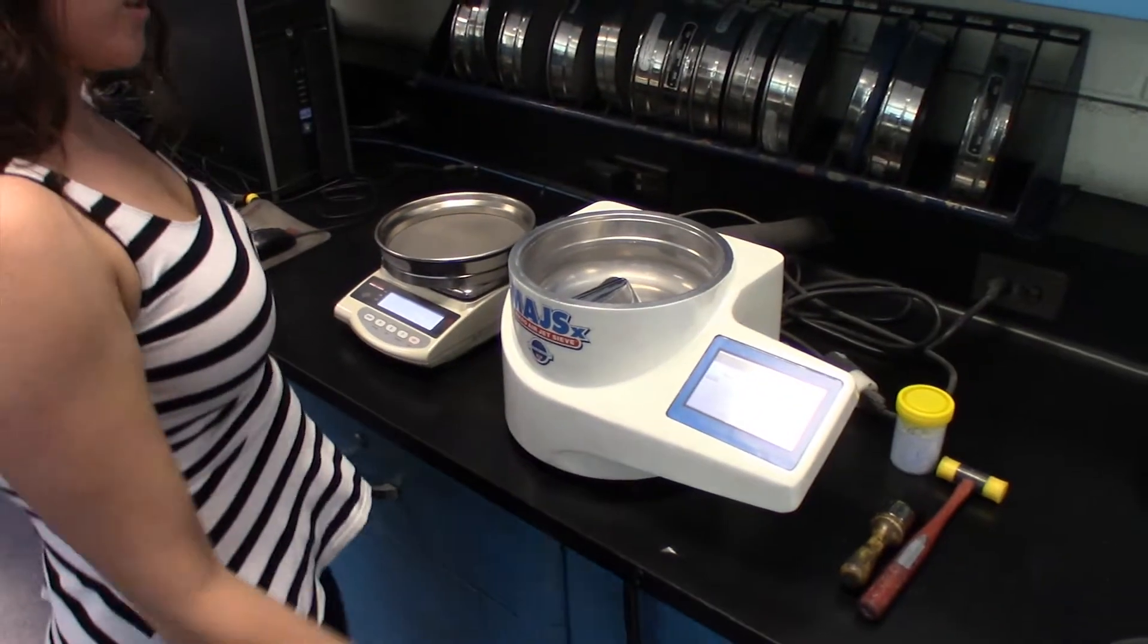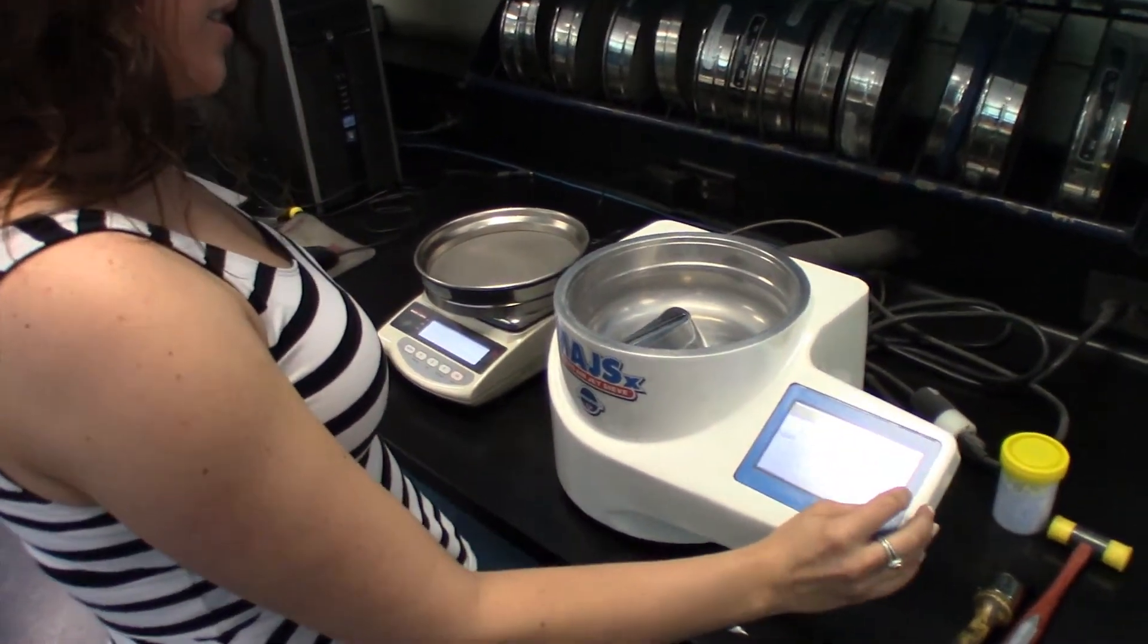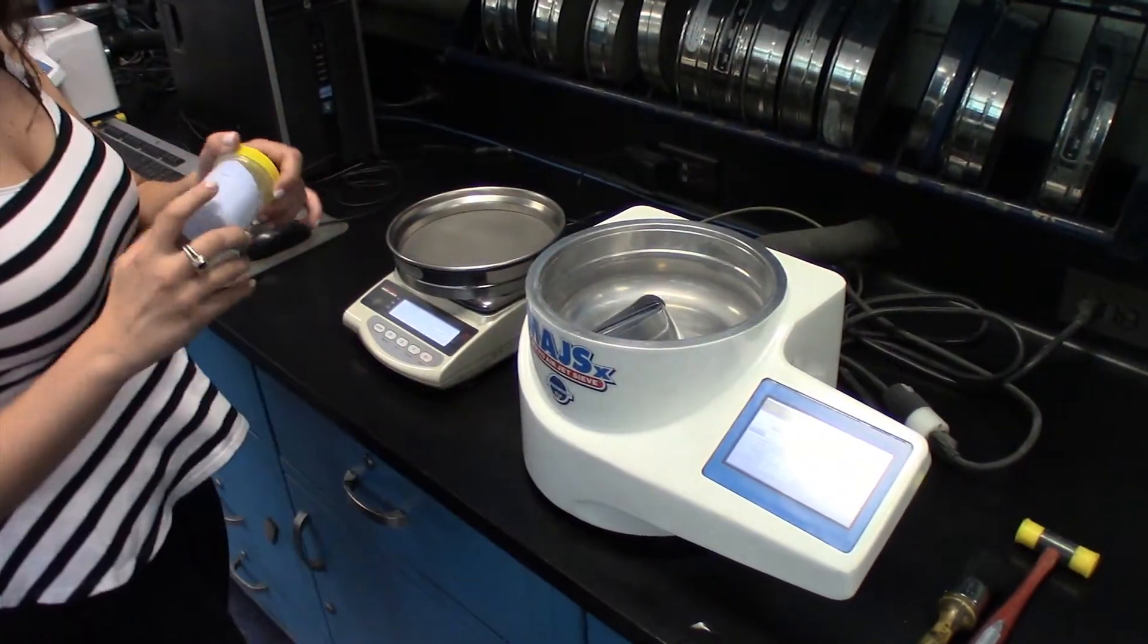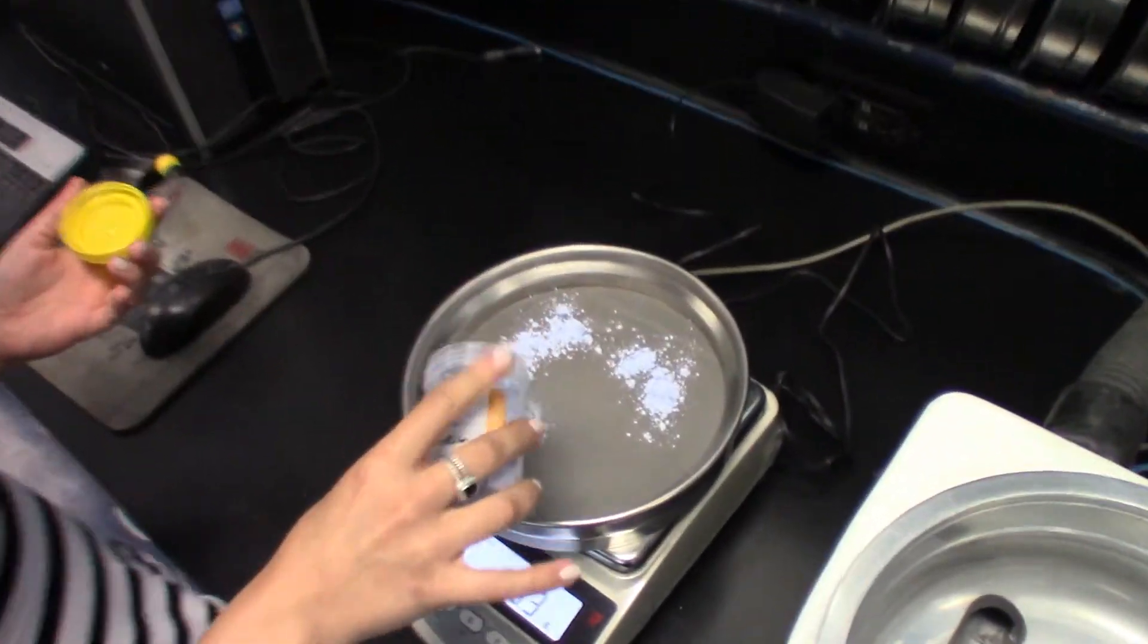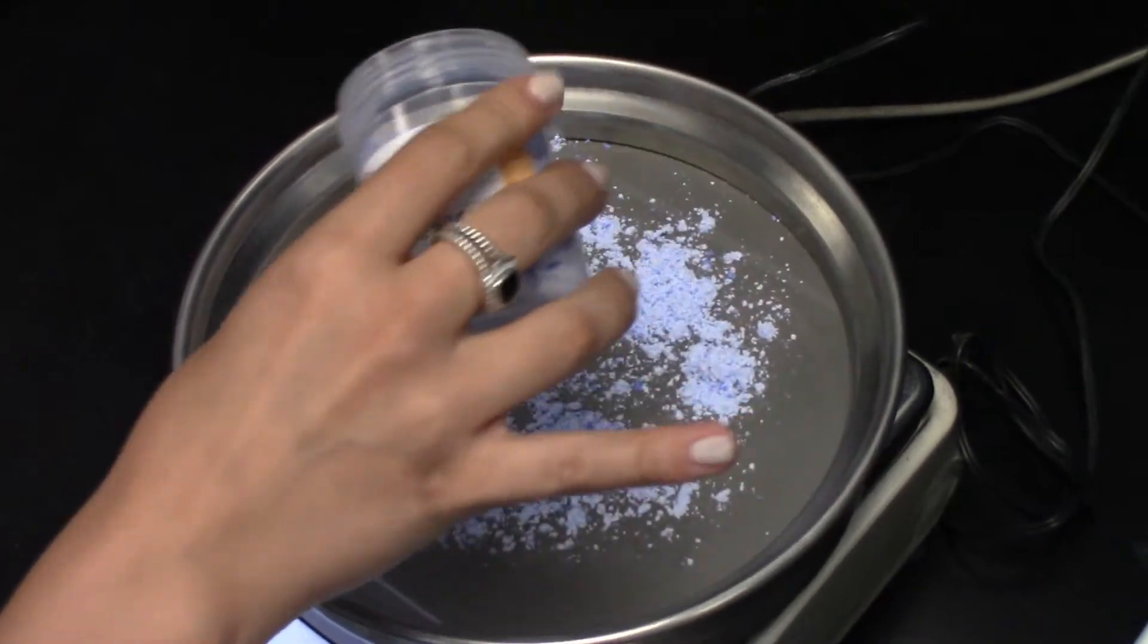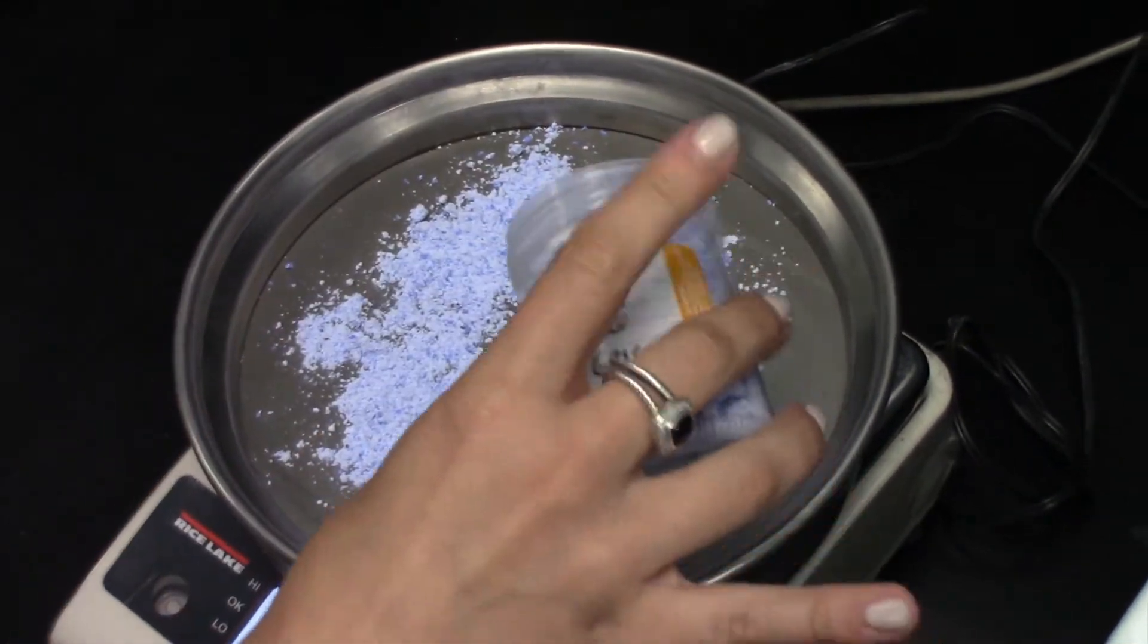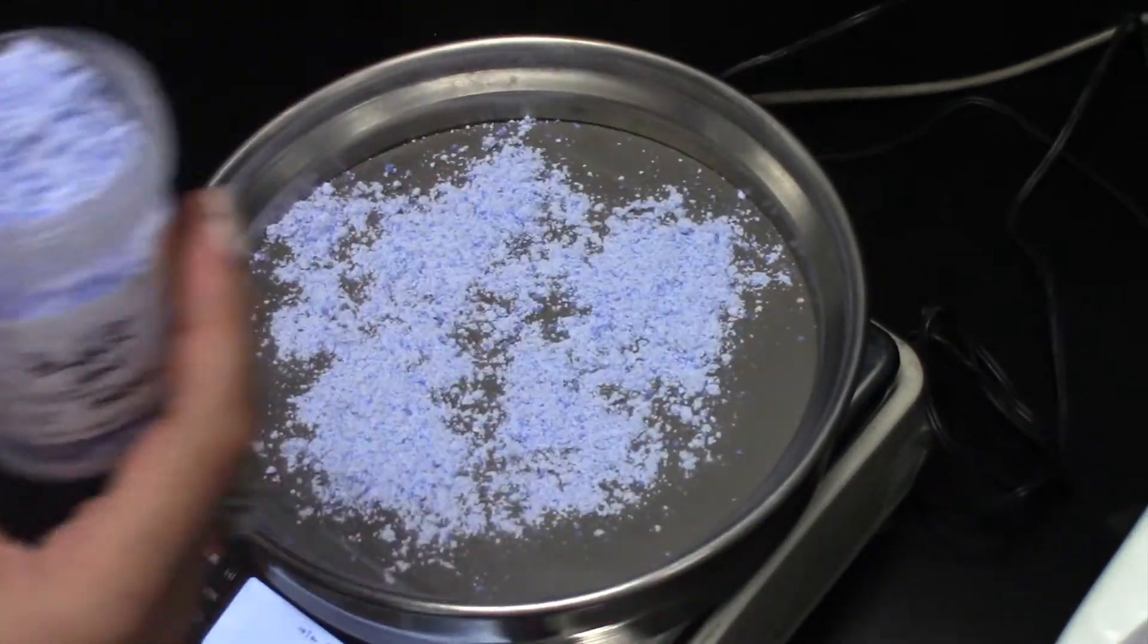Once the scale communicates and is matching, press next. Then I'll add some of my sample. I want to spread it evenly around the sieve screen, that way the sample has a chance to come in contact with the sieve screen.